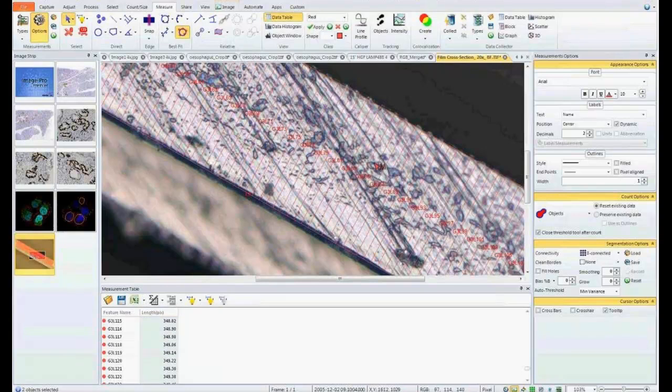You can show and hide if you need to hide these layers, or hide these lines defining the layer. We can remove those and just be left with all these measurement probes.